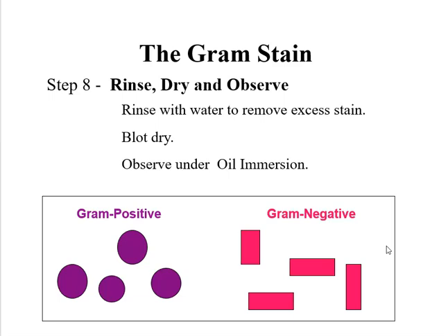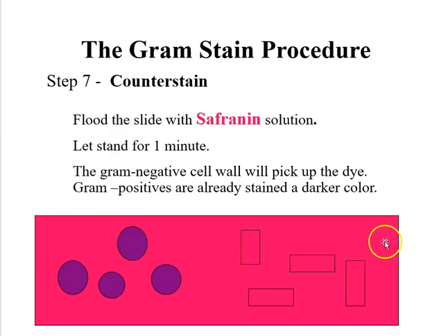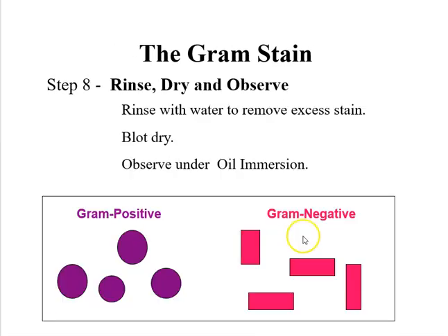Okay, so your gram positives are going to have a lot of information about the shape that's important, because it'll tell the doctor, do I have a bacillus, which is gram positive bacilli? Do I have a streptococcus, which is gram positive cocci in chains? Or do I have a staph or something like that, which is gram positive cocci in clusters? Or do I have them only in diplococci, which I may have a diplococcus? Okay, so a lot of information. Gram negatives don't report out the shape because they're bacilli. Okay, so there we go. That's it. That's the gram stain.